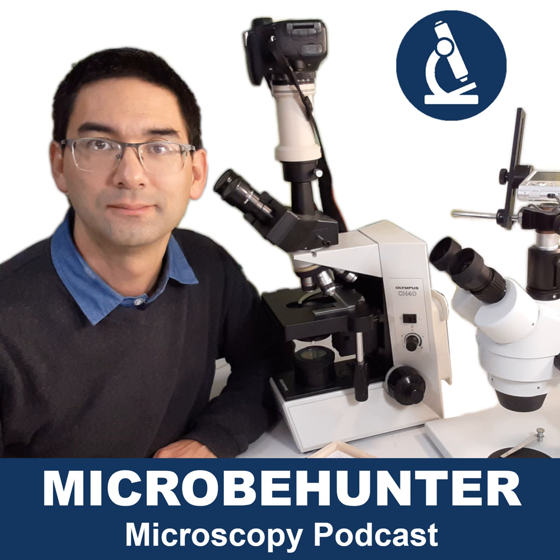Now, I know that there are certain research projects that still are very much observation based, I really think that this is really great, and they use microscopes a lot. I don't know, maybe if you're doing some kind of a biodiversity study of insects, you're probably going to use stereo microscopes on an everyday basis. Or if you're analyzing foraminifera, which can be found in sand, those little shells, well, yeah, I'm quite certain that you will use microscopes a lot. But on the large scale, I feel, unfortunately, modern biosciences are moving a little bit into a different direction.